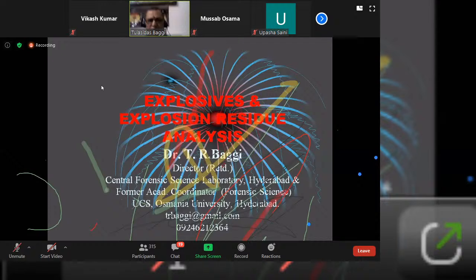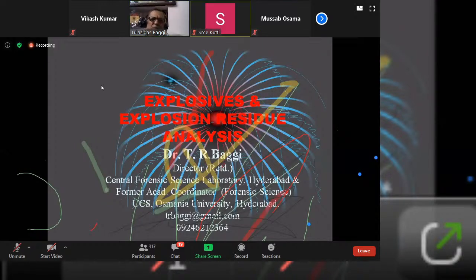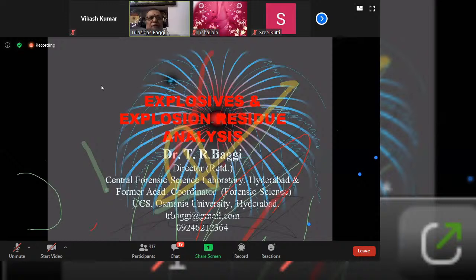In our laboratory, we separated all those things and identified the dye which was used. And from the data bank of the Defense Ministry, we found out that this particular dye was used in Czechoslovakia. That's how the geographical origin can be found out. Many times the composition varies from country to country, and therefore we can find out those things by detailed quantitative analysis.